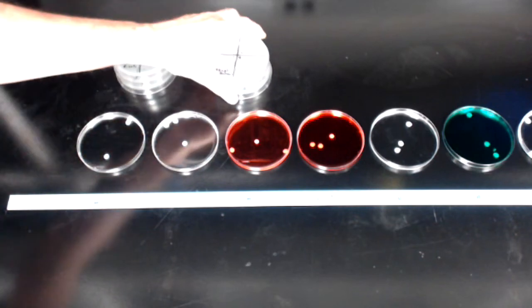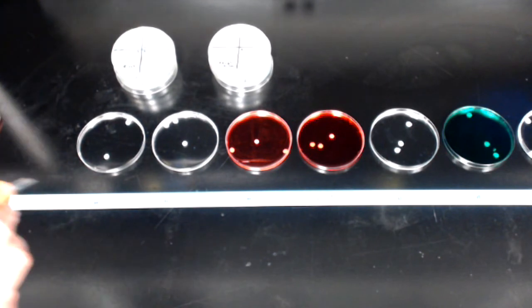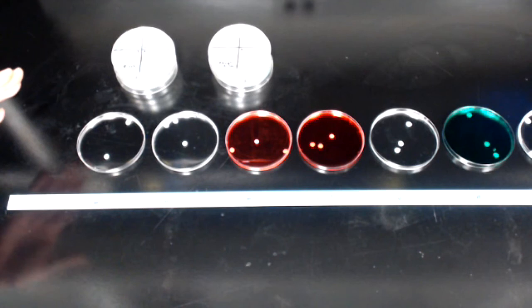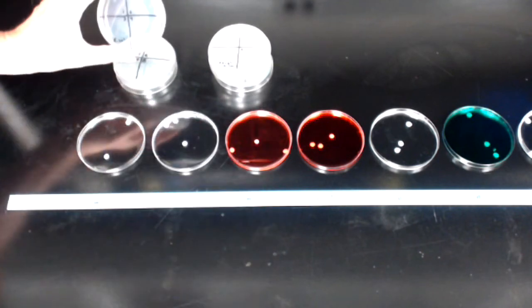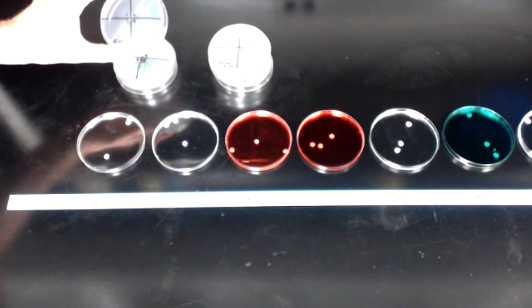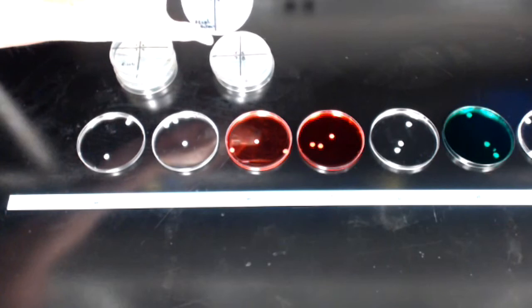And I plan to do the same thing with Staph aureus. So how will this be done? Well, first of all, I'm going to demonstrate placing the paper discs for chemical antimicrobials 1, 2, 3, and 4 onto the E. coli plate that is labeled 1, 2, 3, 4, and onto the Staph aureus plate that is labeled 1, 2, 3, 4.